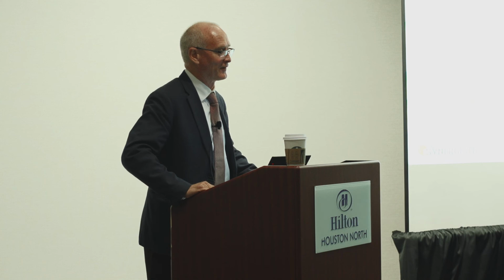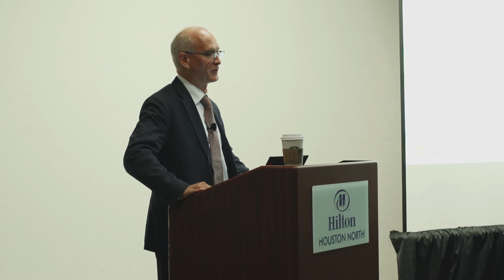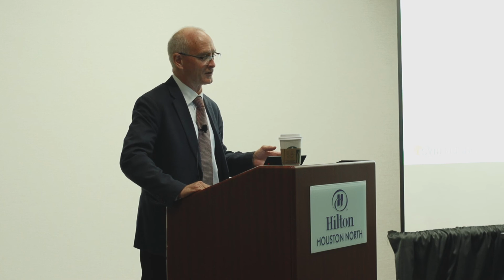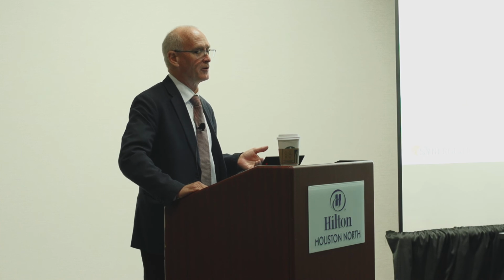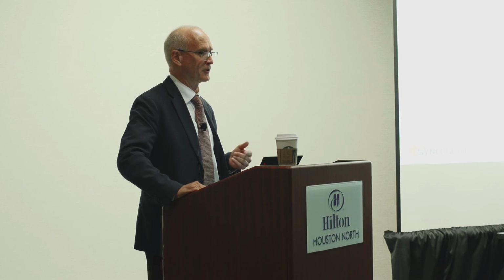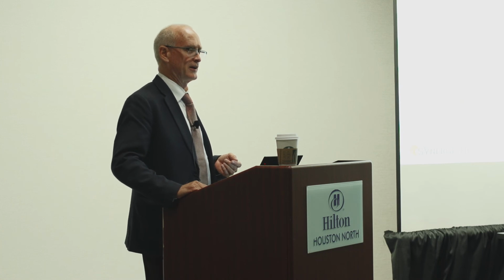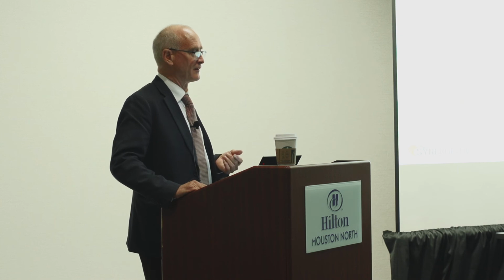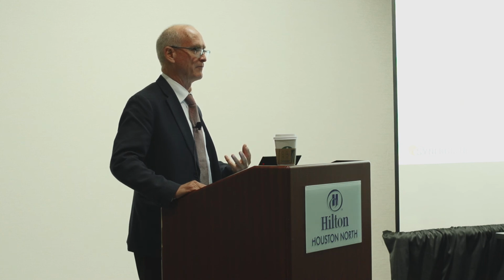So what we want to do now is look at a couple of examples of how the testing matters when you're looking through different parts of the process. We talked about thin layer chromatography, we talked about liquid chromatography, we talked about some of the mobile work that's done there with a mobile unit like a light lab, for example, that we saw, the orange box. There's other technology that allows you to look at infrared and those things can be done very quickly. The other process that we want to see is how you apply it and why it makes sense.